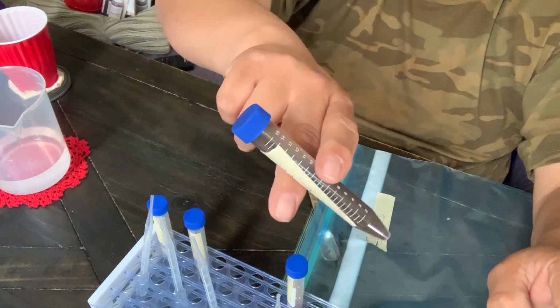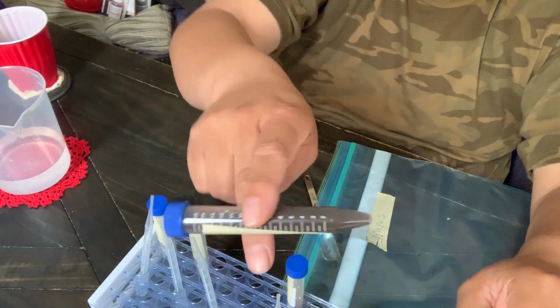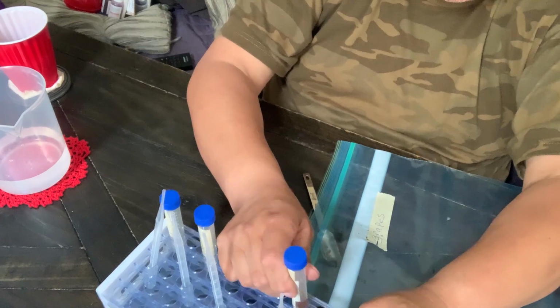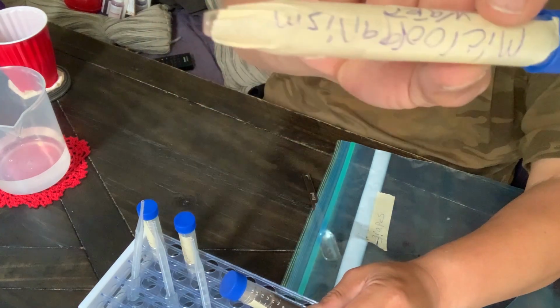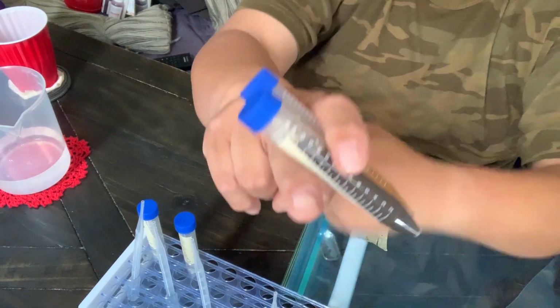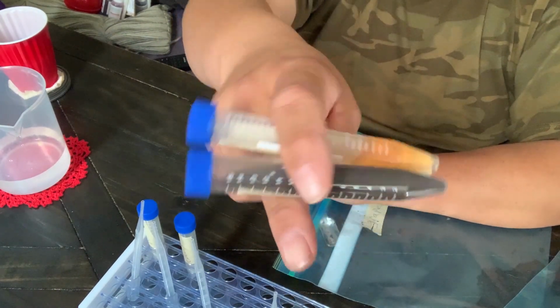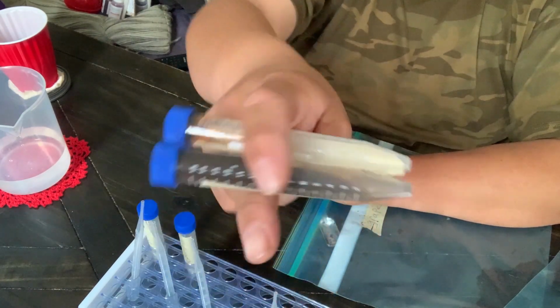All right, so this is all it is. It's a gentle roll. This is all it takes to mix it up in there. So I think I have to do 2 at a time. Here's the other one. This is our compost water, microorganism water that we're making over there. So we'll just put 2 fingers like this, and then it's a gentle roll. And you do that for about 1 minute, 2 minutes, just so everything gets mixed in there.